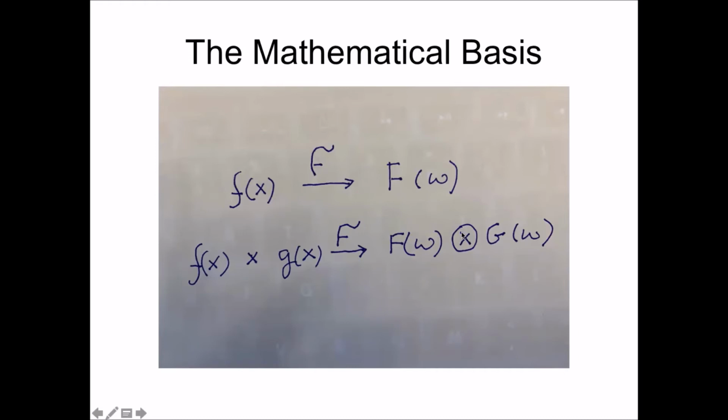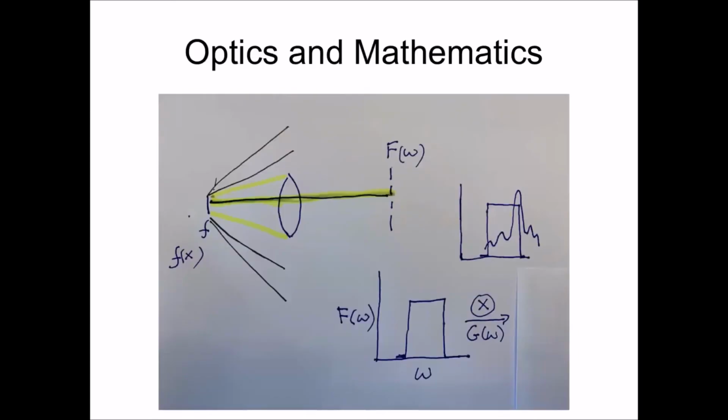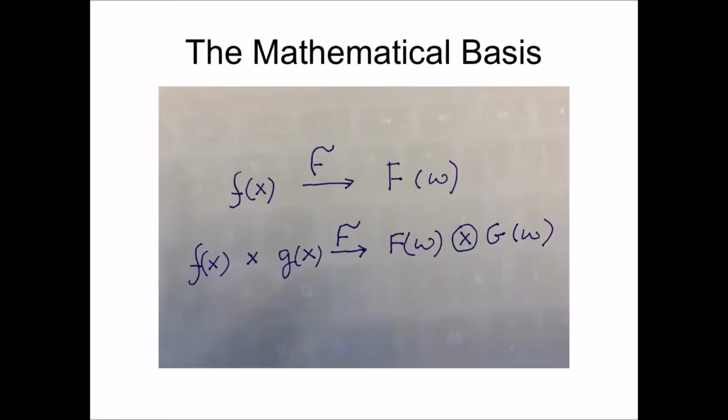In the Fourier plane, you have a convolution, okay? I'll show you what that really means in a moment, okay? Basically, what structured illumination is, you take f of x, and you put in front of f of x a grating. You illuminate through a grating with higher frequencies. So the grating is near the sample. You try and capture those higher frequencies that I told you were lost because you are not in close with a lens to the surface.